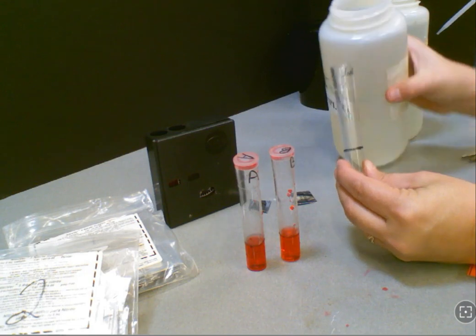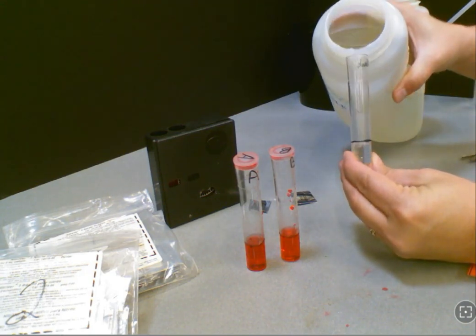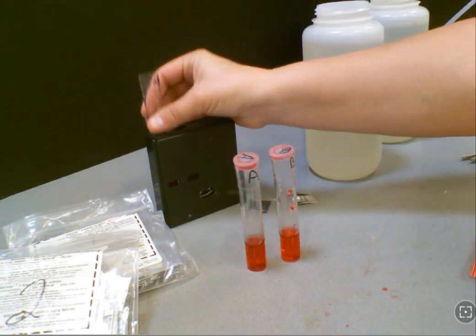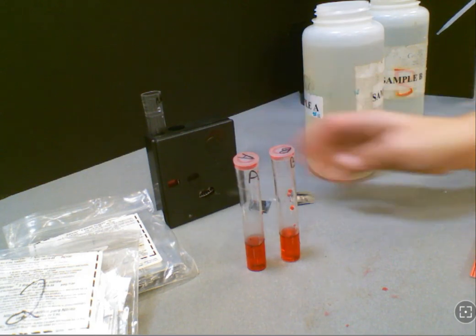While you're waiting you're going to get some untreated sample water and set it into your extra sample tube up to the black line or the bottom of the tube, and set it into the hole on the outer left side of the comparator.